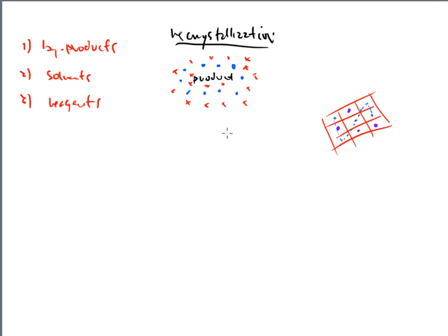So what we do in recrystallization, step number 1, is that we have to dissolve, most of the time, my product again. I know, it's very annoying. I mean, here I've just maybe spent 2 or 3 days getting the product. I finally have this product. I see it in my flask.